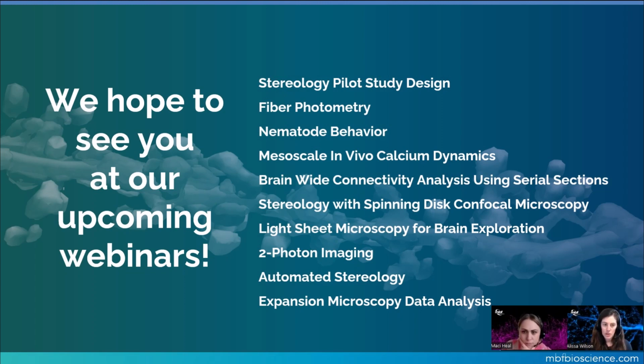Another question had come in about, is Vesslucida included in Neurolucida 360? And yes, with the Ultra package, it is possible to trace your neurons and vessels all in one software now, which is very exciting. We'll still be offering Vesslucida 360 as well for those Vesslucida users, but we've ported the vessel tracing algorithms and analysis options into the Neurolucida 360 Ultra package.